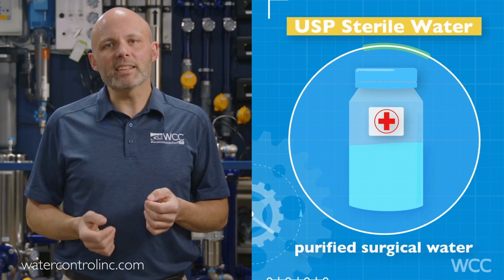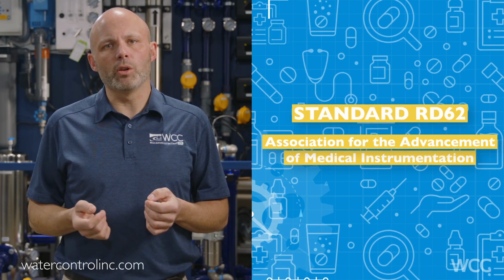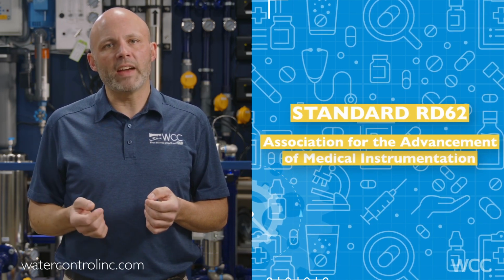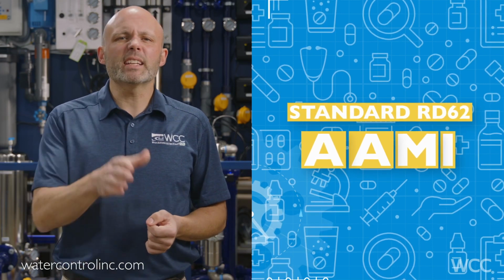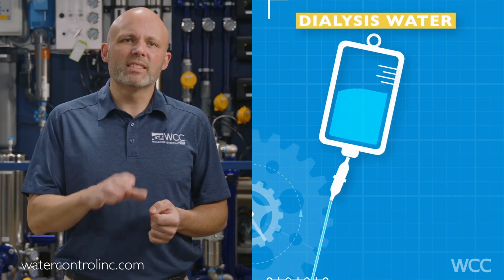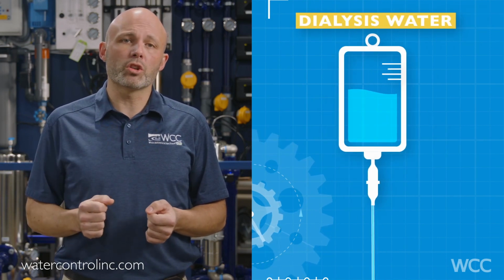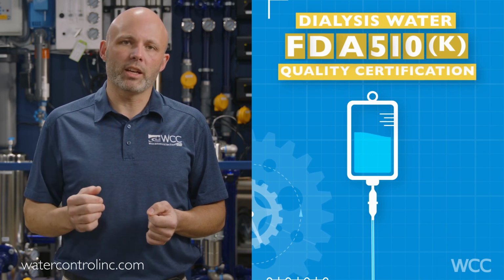If hemodialysis is your game, your water will need to comply with standard RD62 of the Association for the Advancement of Medical Instrumentation, AAMI. It contains very strict requirements for many individual contaminants. Systems sold for dialysis water should also have FDA 510K quality certification.